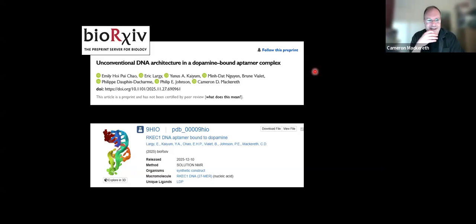So it's not like normal organic chemistry NMR where you can count up the hydrogens, and 3 hydrogens means you have a methyl group and things like that. So in this case, we wanted to see if you could quickly add the ligand and see the expected change of structuring, but it's been a little bit more complicated than it would appear.